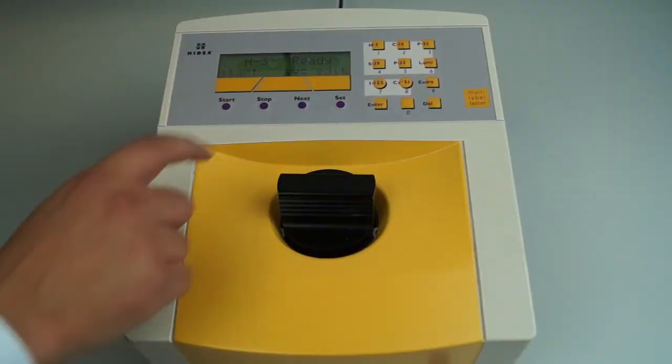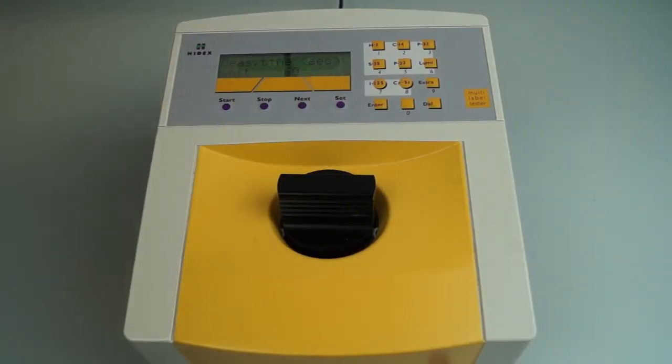Settings such as counting time or energy windows can be changed from the machine if necessary. The Triathla can store measurements to be retrieved at a later date, either from the screen or from software linked to a PC.